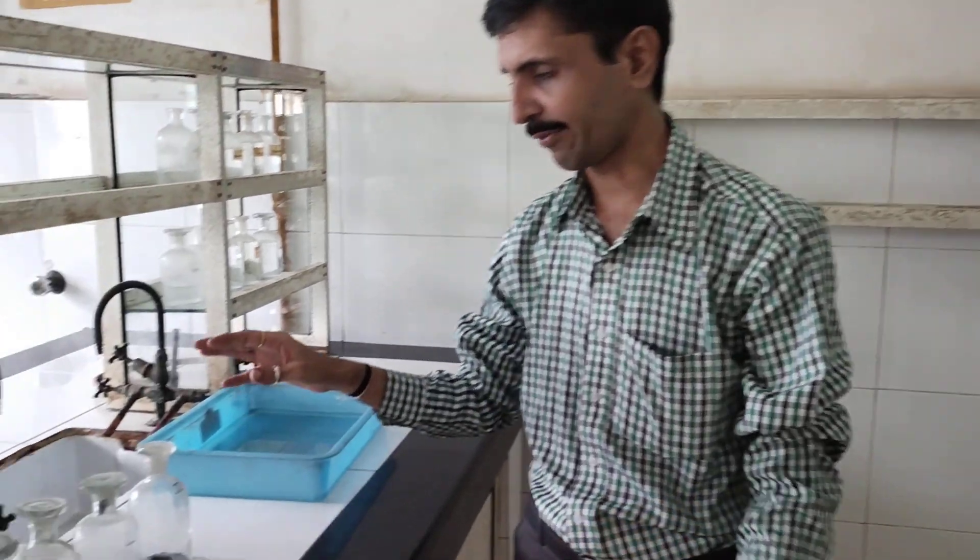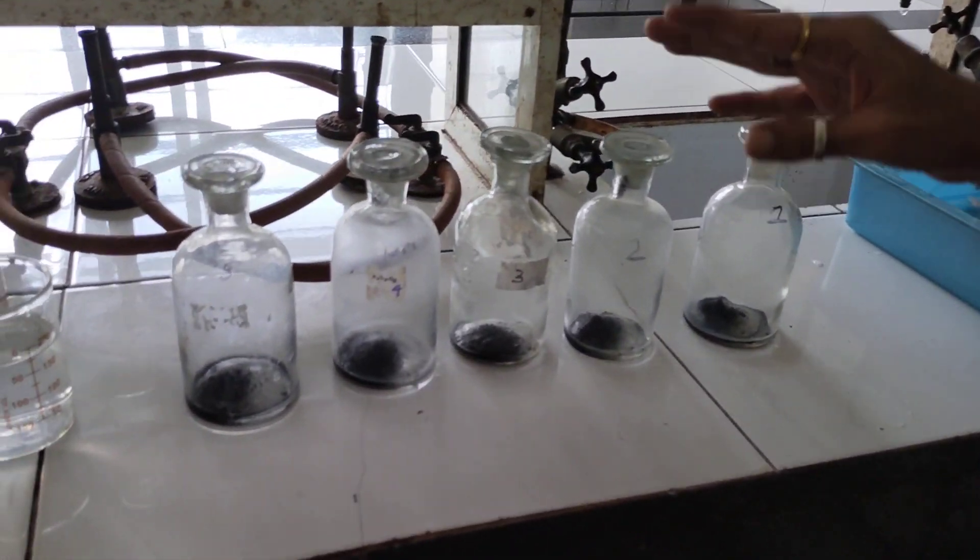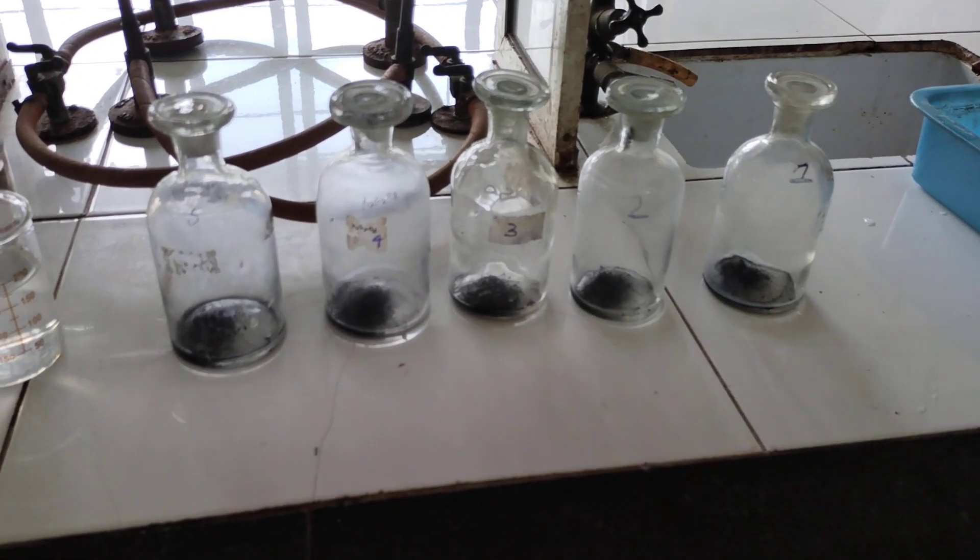Hello my dear friends, I welcome you now for the practical setup. Here we go — these are the 5 bottles which I was mentioning when I was explaining the theory part of this particular experiment.